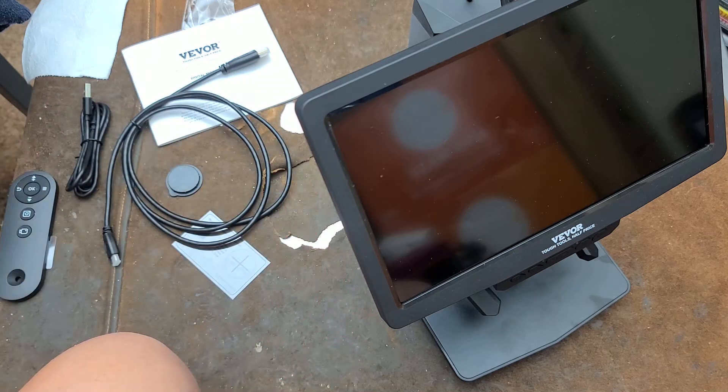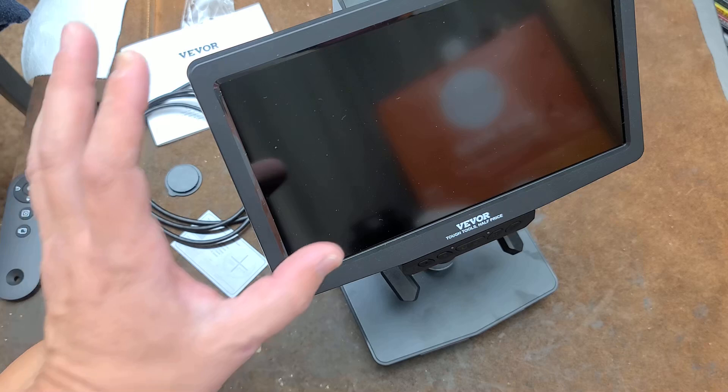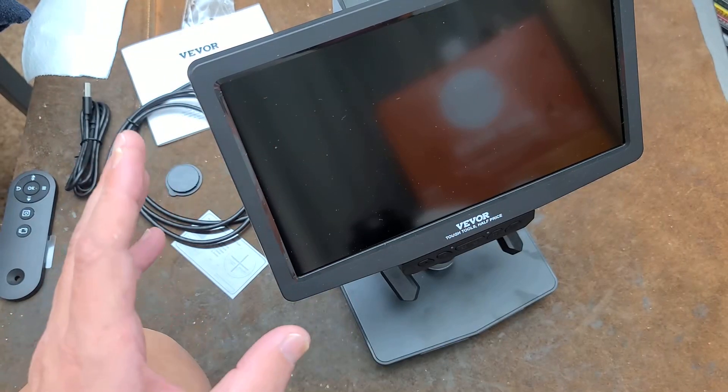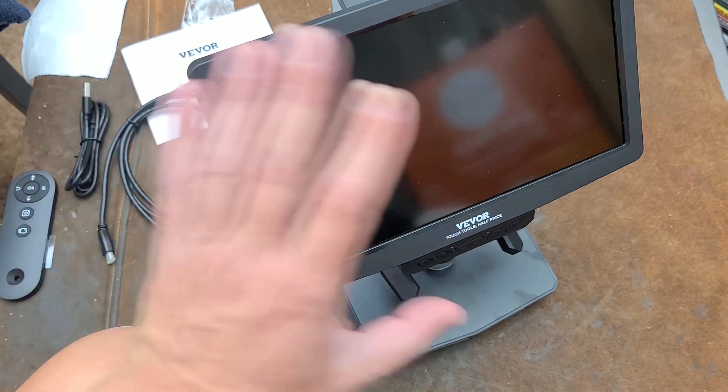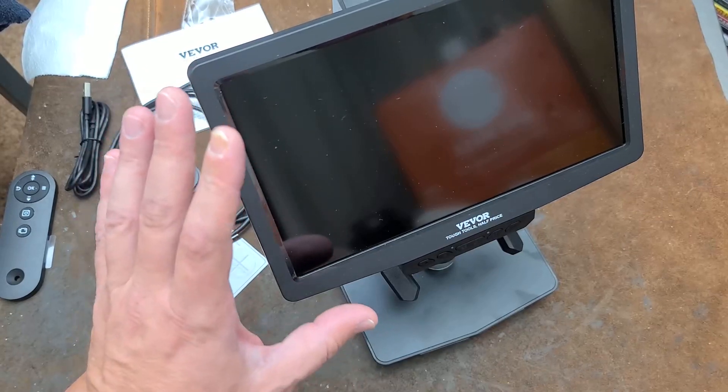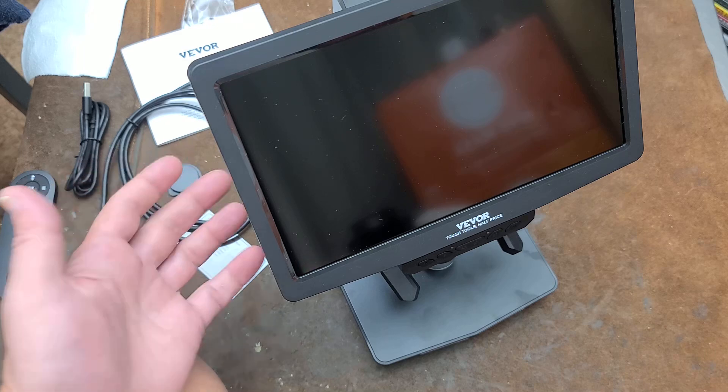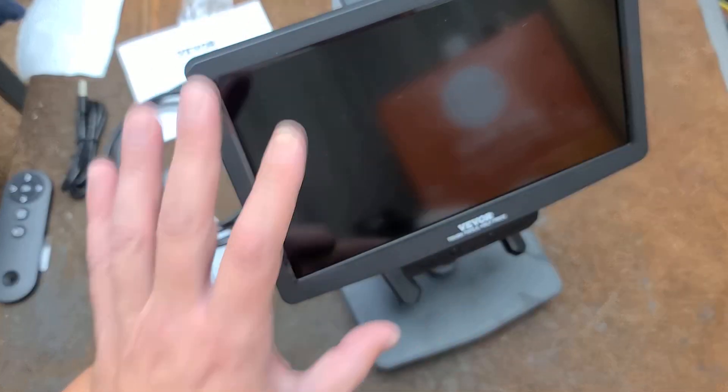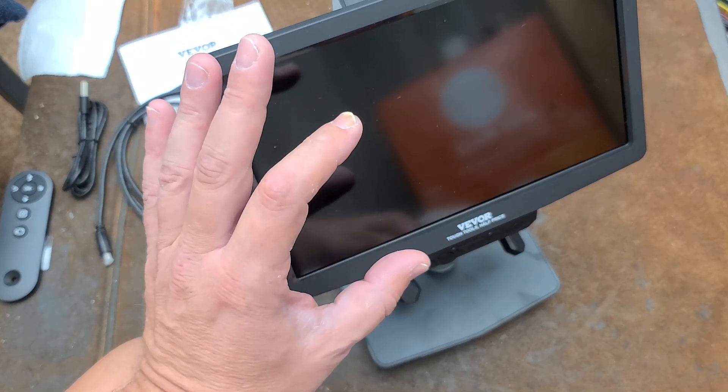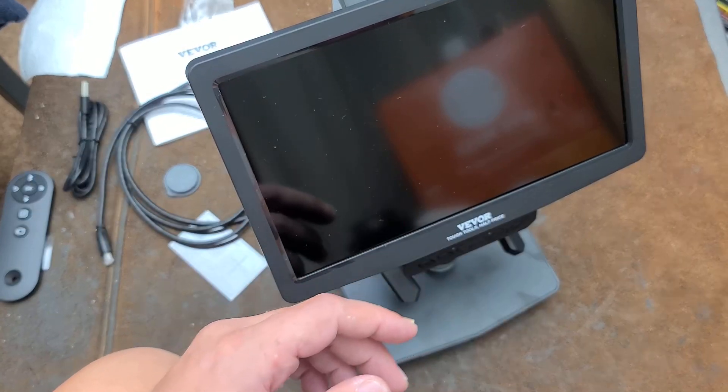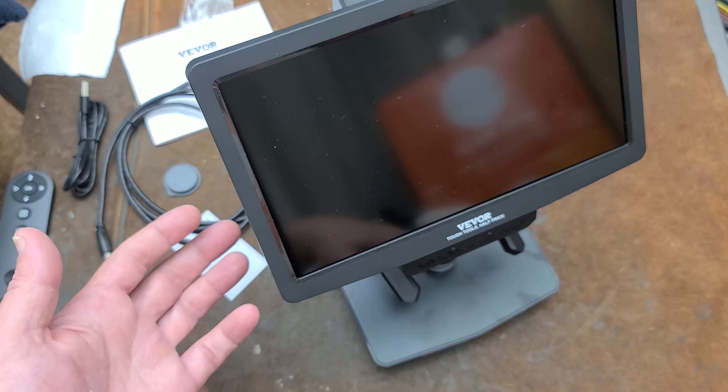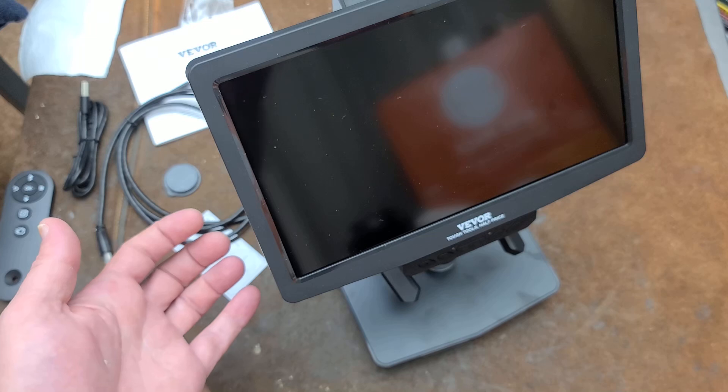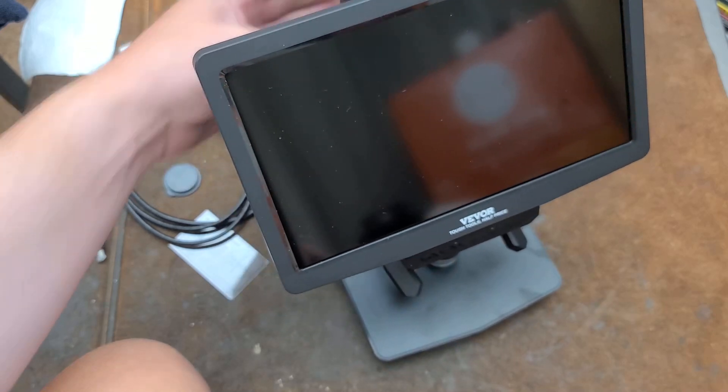Other than that, these things, people oftentimes get the little six inch ones, little eight inch screen ones. The bigger deal about like a 10 inch screen one is it gives you enough screen area where that's already giving you like a much bigger view and even zoom just to begin with, or magnification. They're easier to see and you tend to get a lot more range being able to focus on something and you get more pixels. The problem with like the little six inch ones is that they're like really low resolution screens. You just don't get much detail and so those types of digital microscopes just aren't very satisfying. One like this offers more than enough magnification for working on electronics and watches and just so many different things, and especially when they're just smaller and more portable like this.